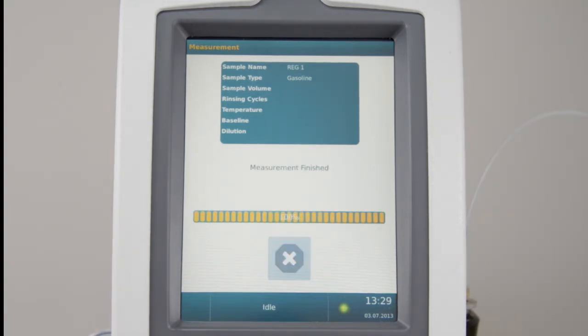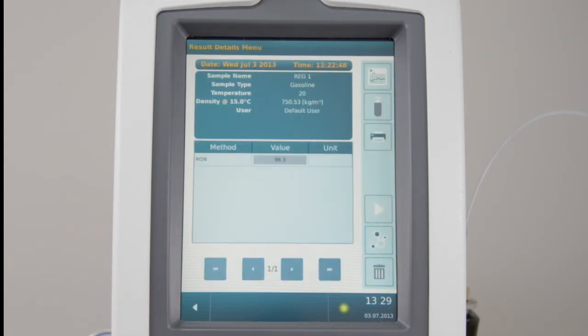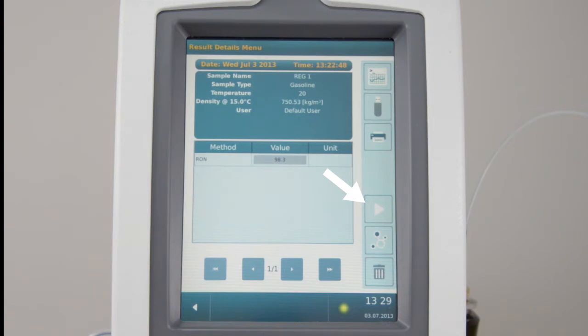Once measured, you can review the result and the spectrum or start a new calibration measurement.